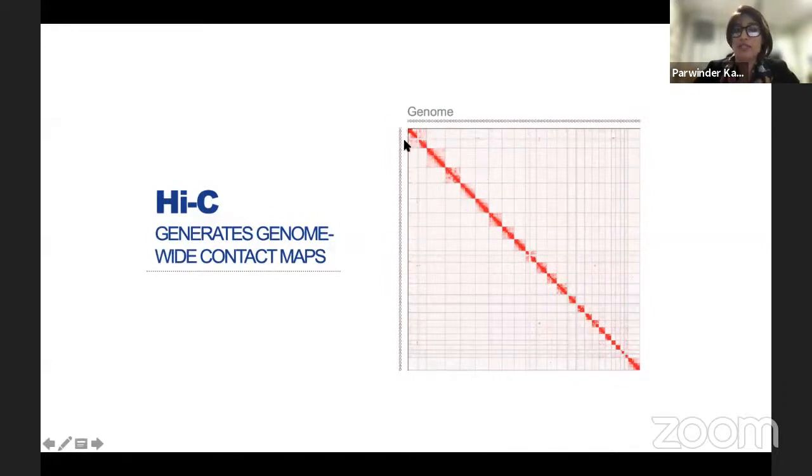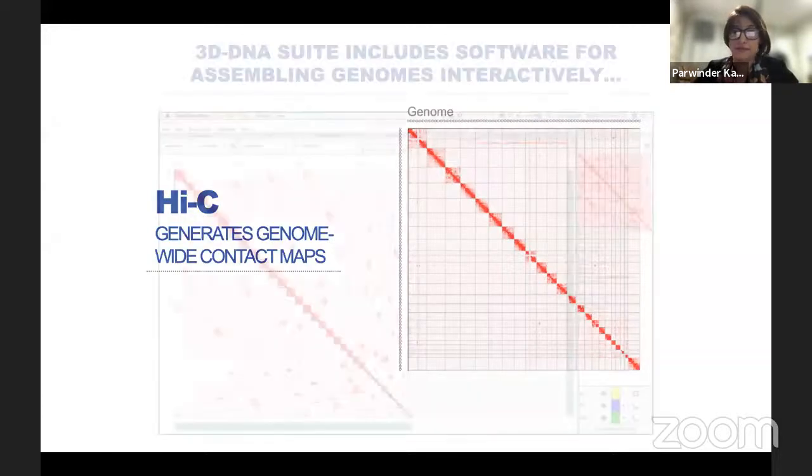And you start to see these little squares, or enrichment squares. And these enrichment squares are very similar to what you saw in Homer Simpson's little symmetrical matrix. And these are your little chromosomes. Problem solved, isn't it? This was one of the longest standing challenges of the genomics field, to assemble chromosomes at a chromosome length assembly. The day we got to start to do this, this has made life super, super easy.